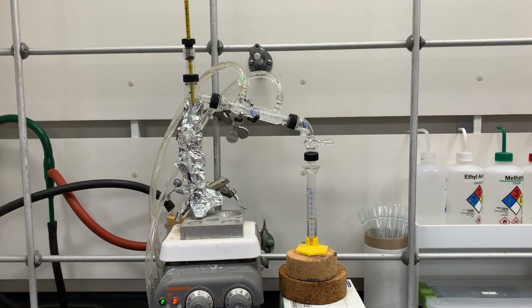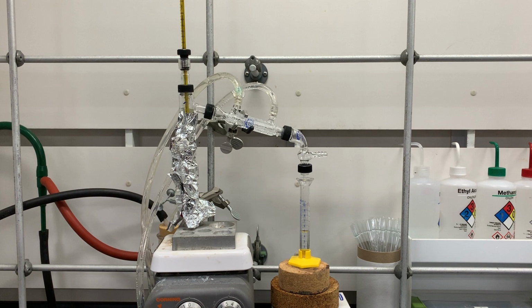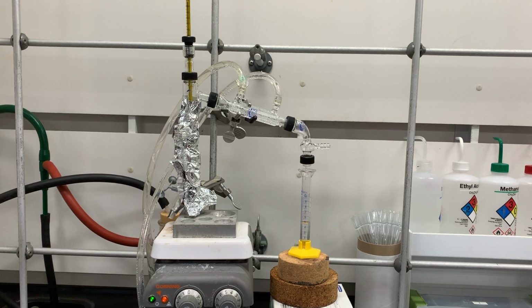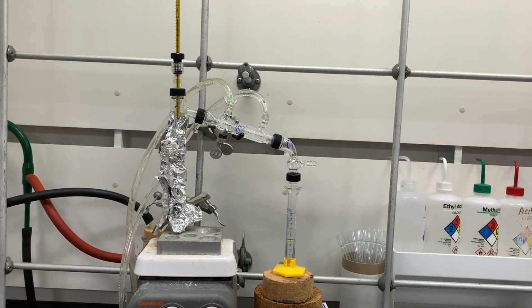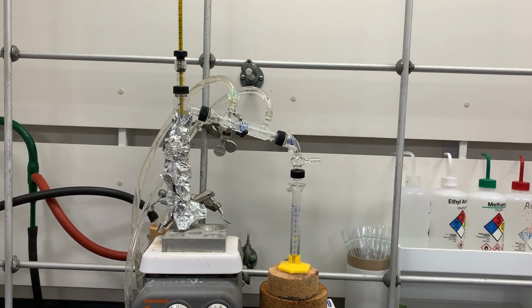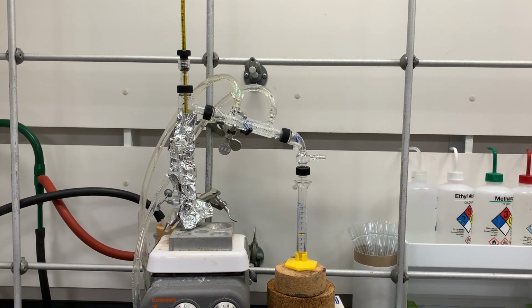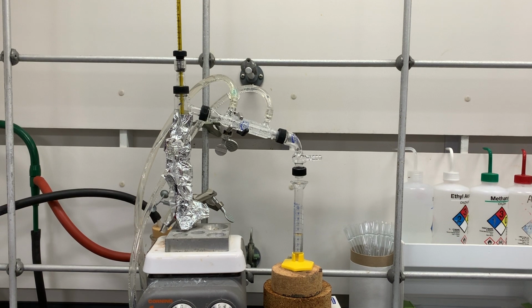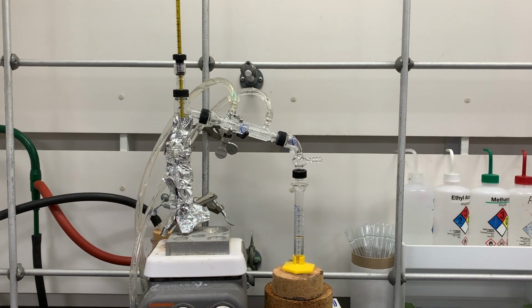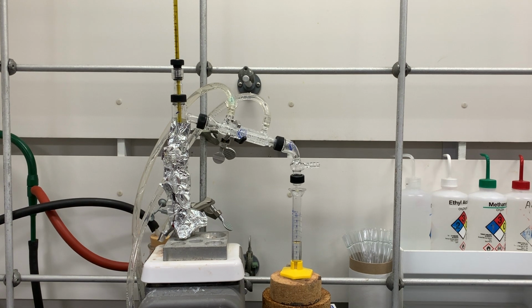Now you can see there is a little bit of tinfoil around the system, which wasn't before. If you are waiting and your compound is not distilling over, you can choose to insulate your Vigreux column and your round bottom flask with tinfoil, which will make the system heat up a little faster. So that is one option to do, to insulate your system with tinfoil, as you see here, and then your liquid should distill. The distillation will be just as accurate. It will just distill in a more timely fashion.